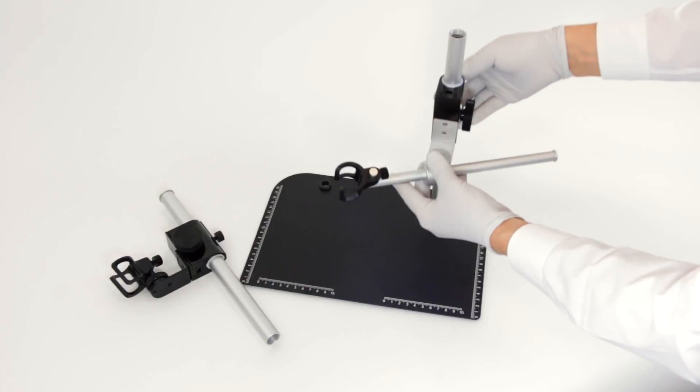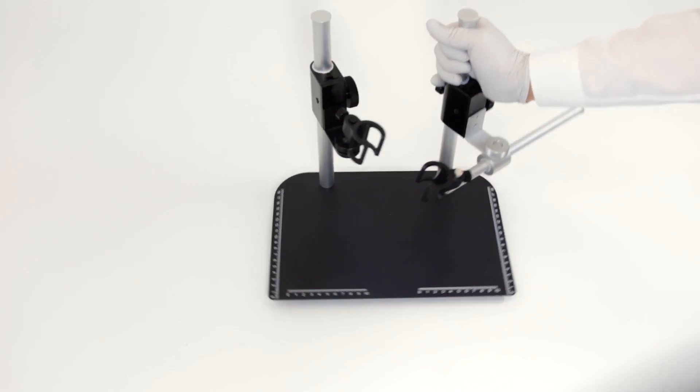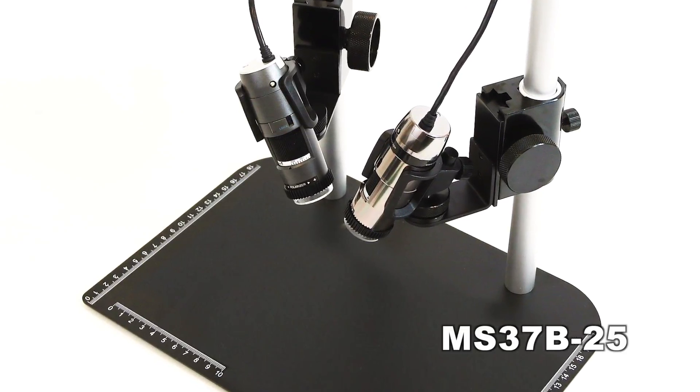This stand comes in three versions that vary in the type of viewing block assemblies that are included. The MS37B25 includes two standard blocks with fine adjustment.